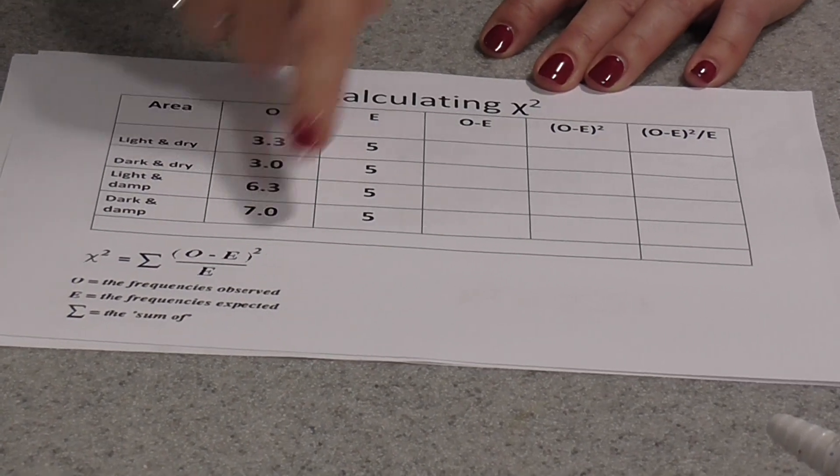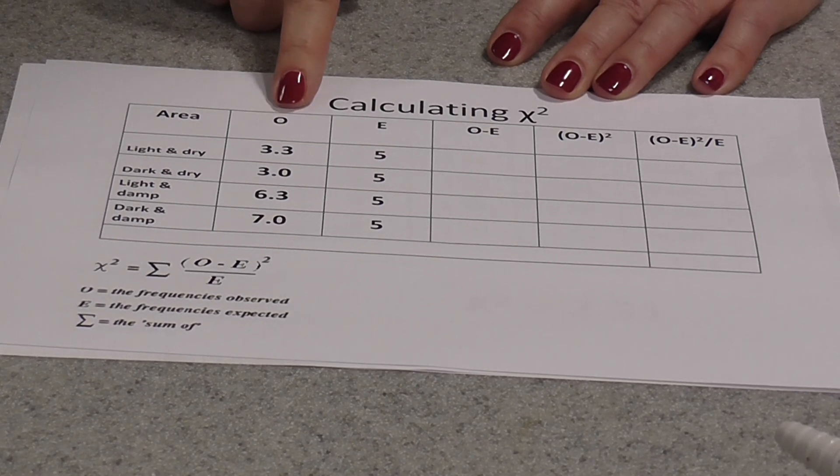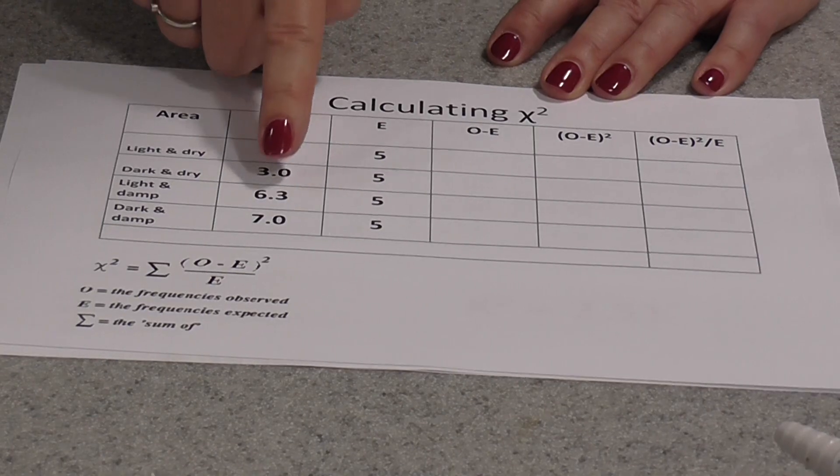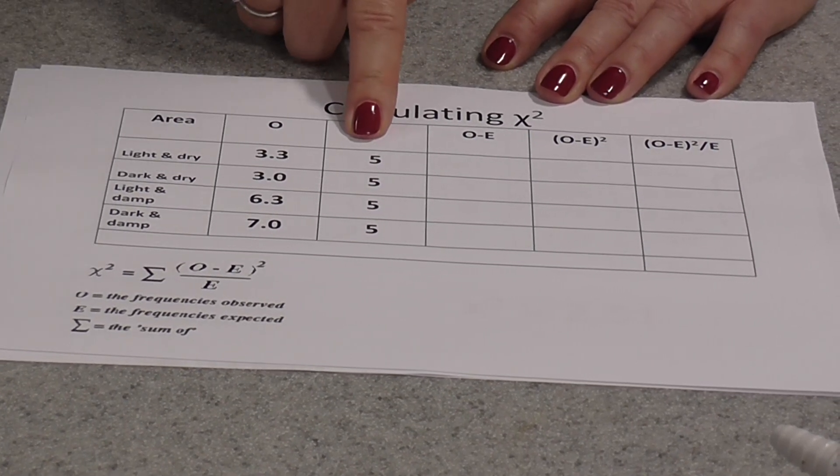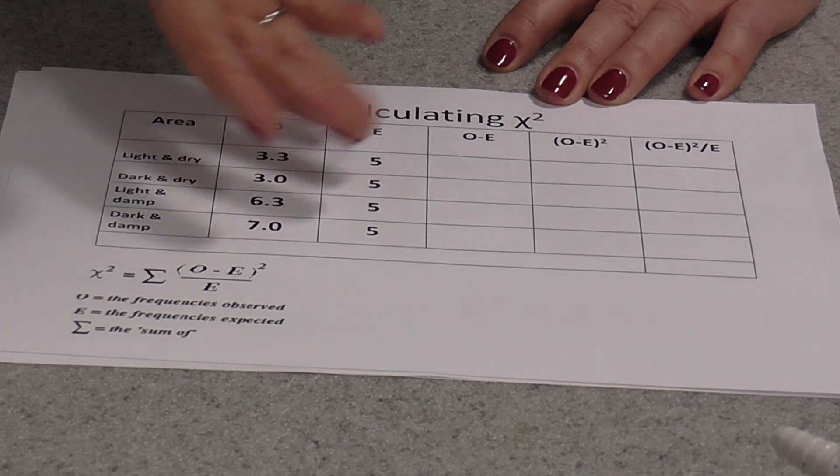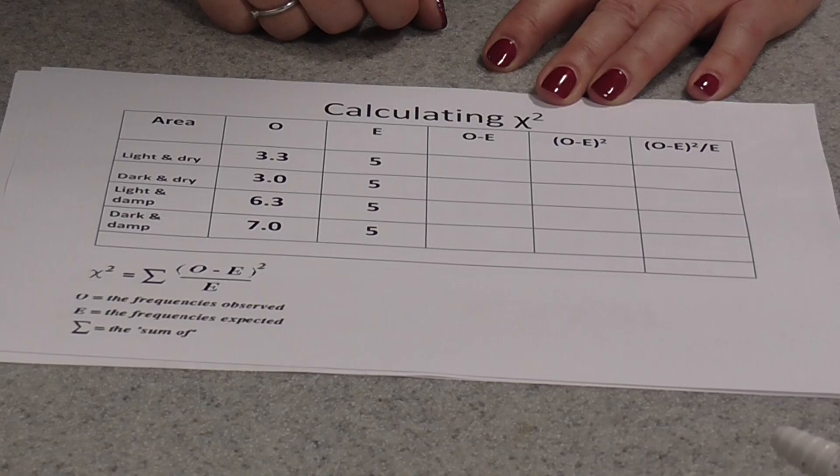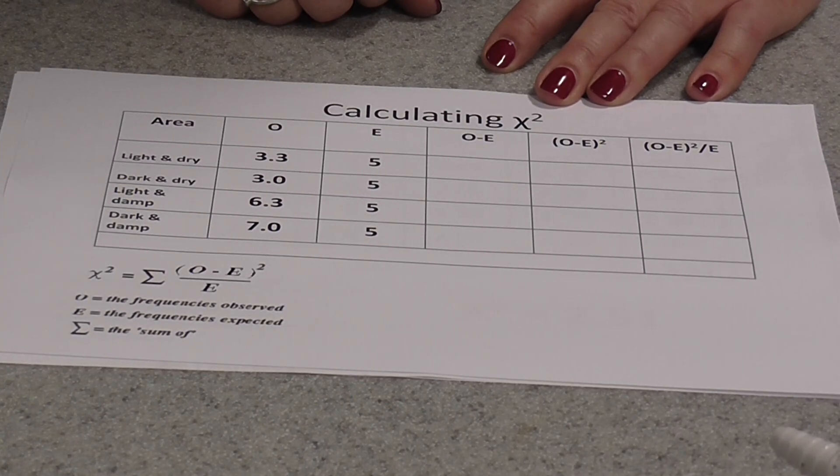So you see here in the first column, I've got my observed results. So that's the means that I've just calculated from my raw data, the mean number of wood lice in each area. The expected results in this case are all five because I used 20 maggots. And if the maggots have no preference over where they moved, we should expect to get them pretty evenly spread. So five in each section.